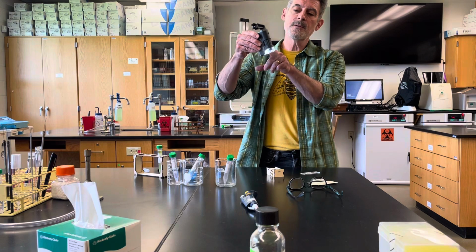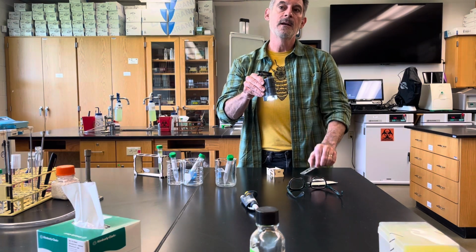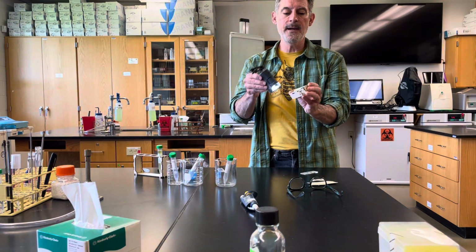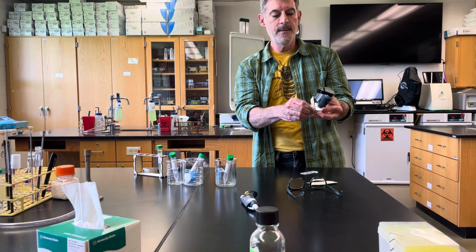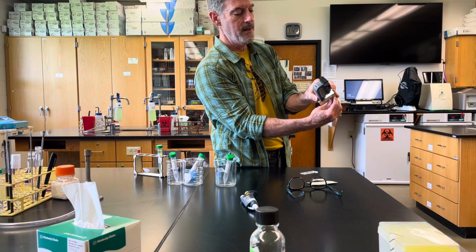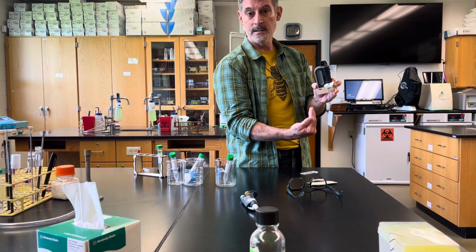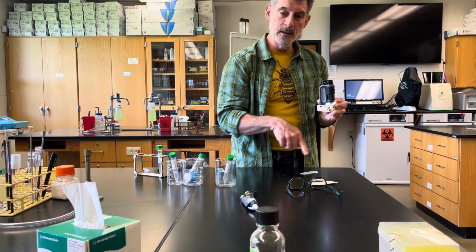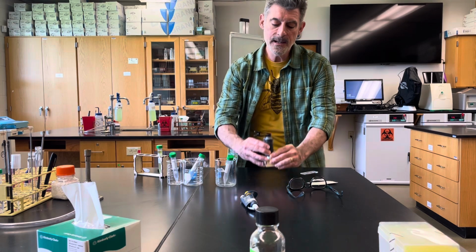So when this microscope shines the light down, it's going to hit the surface of the slide, and that's all you're going to see is the light coming from the top. But with this particular base, when you put the microscope on it, there's a mirror in here. And then with this little knob, you're going to be able to turn that mirror and adjust the angle of the light that's coming back up at the slide, and you're going to get really good contrast. You're going to see the little grid. There's a grid etched onto the slide. You'll see the cells.